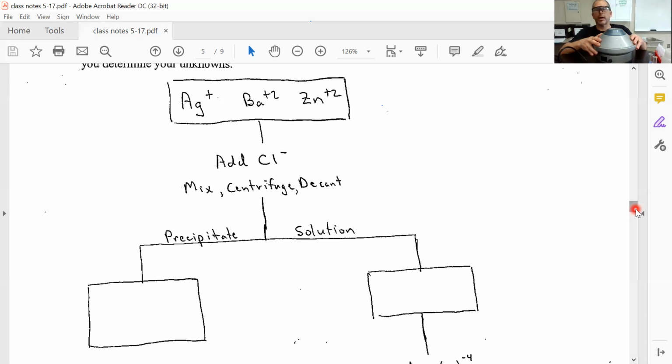And sometimes those test tubes have a chip on the outside. You don't want your finger to go in there. If it catches that, it could cut your finger, and the blood would go in the test tube. It would interfere with the results, and it wouldn't be safe. Okay, now I shouldn't put my hands up here, but I'm professionally trained to put it way on the side, so there's no way my fingers can get touched. I can stop that a little bit more quickly.